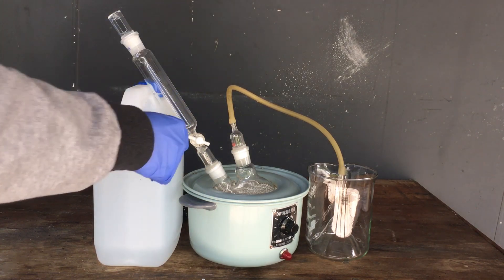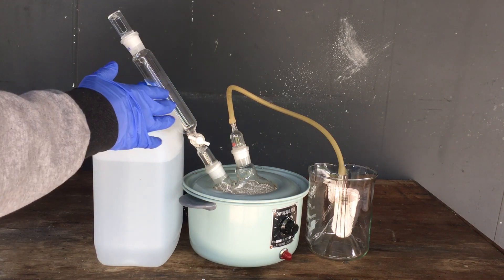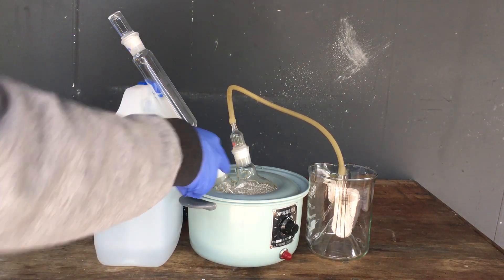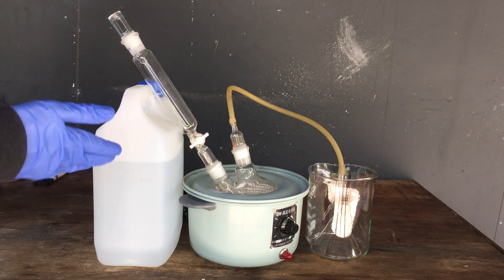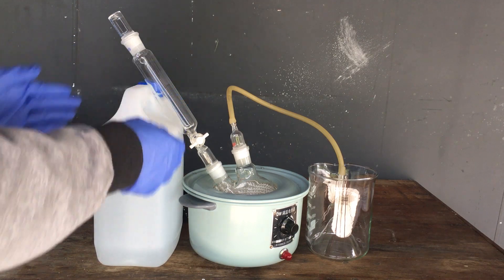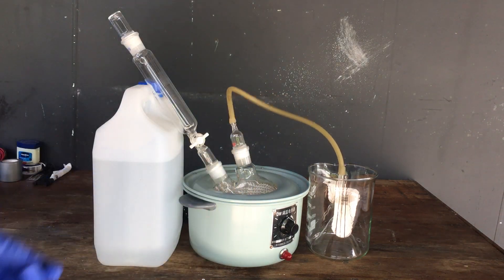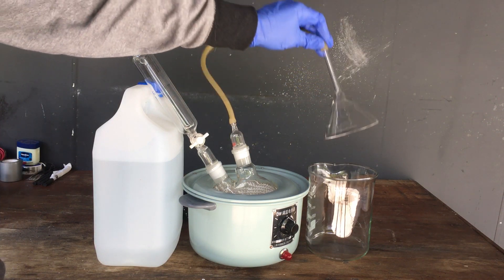What we've got here is our pressure-equalized addition funnel. We'll fill this with a strong solution of sodium hydroxide, and we'll be able to slowly drop that in to our ammonium sulfate in the two-neck flask. It would be nice if my lab stands had come in the mail before making this video, but we'll just balance it as well as we can. Then basically what we have is our gas take-off, which once we drop our sodium hydroxide solution onto the ammonium sulfate, the ammonia gas will have nowhere to go other than through this tube.